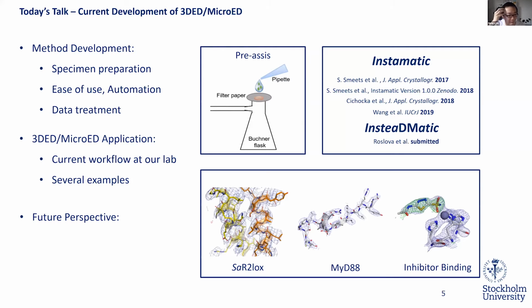After that, I'll talk about some of the applications where we've been using 3D ED and micro-ED to solve structures. I'll talk about the current workflow in our lab, and I'll show several examples. And then I will be wrapping up with the future perspectives.